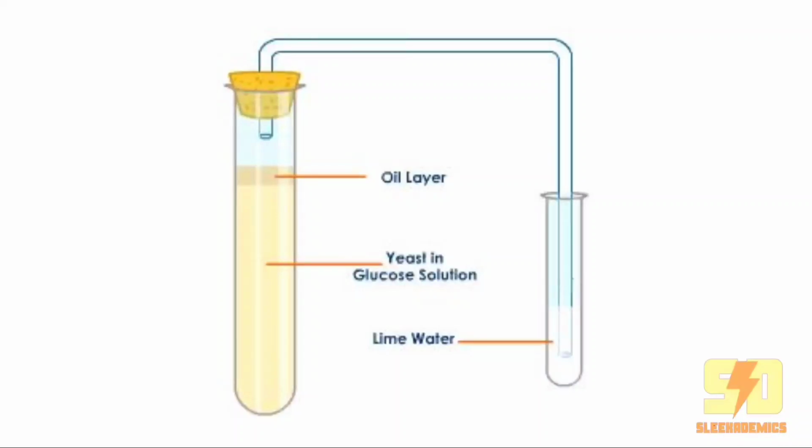Also, a control experiment could be set up, and the control experiment will have everything as mentioned earlier apart from the yeast.